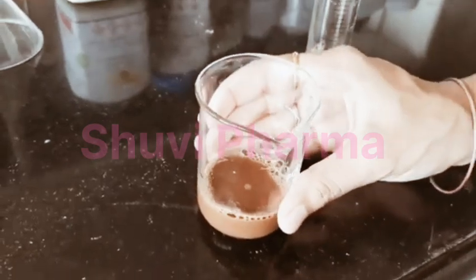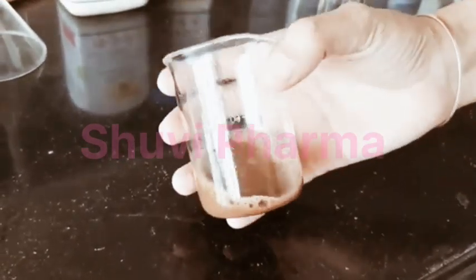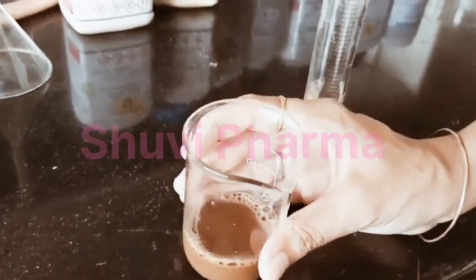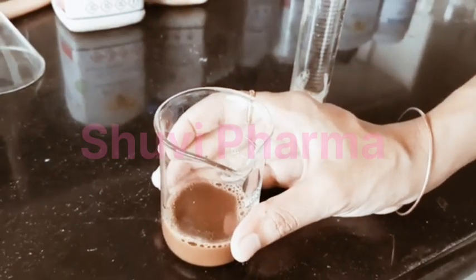Now for physical appearance, that is organoleptic characters. So color, it is brown in color. And its odor is rose-like, as we have used the rose oil as a perfume. Now we will check the pH. Then we will perform the solid content.